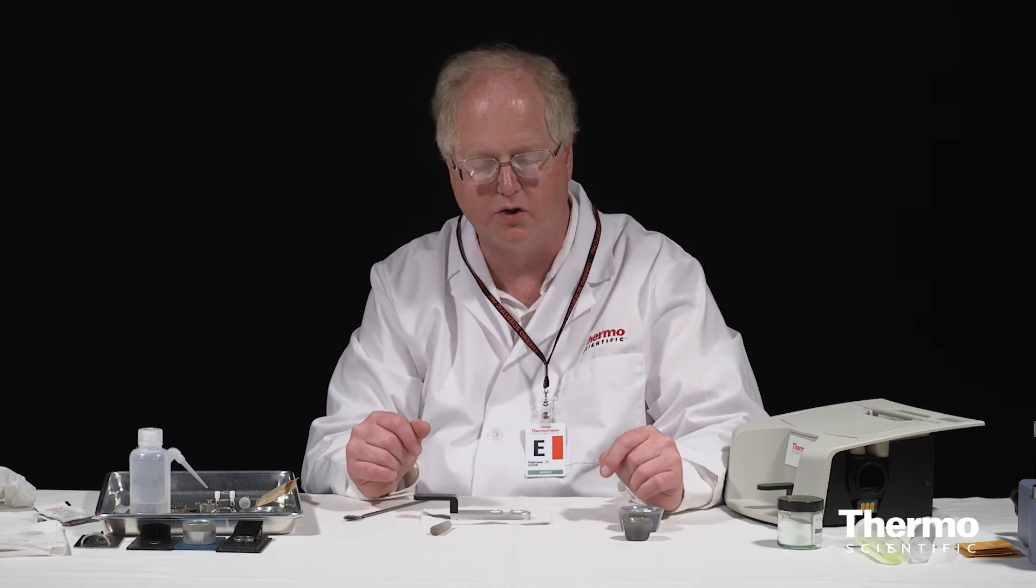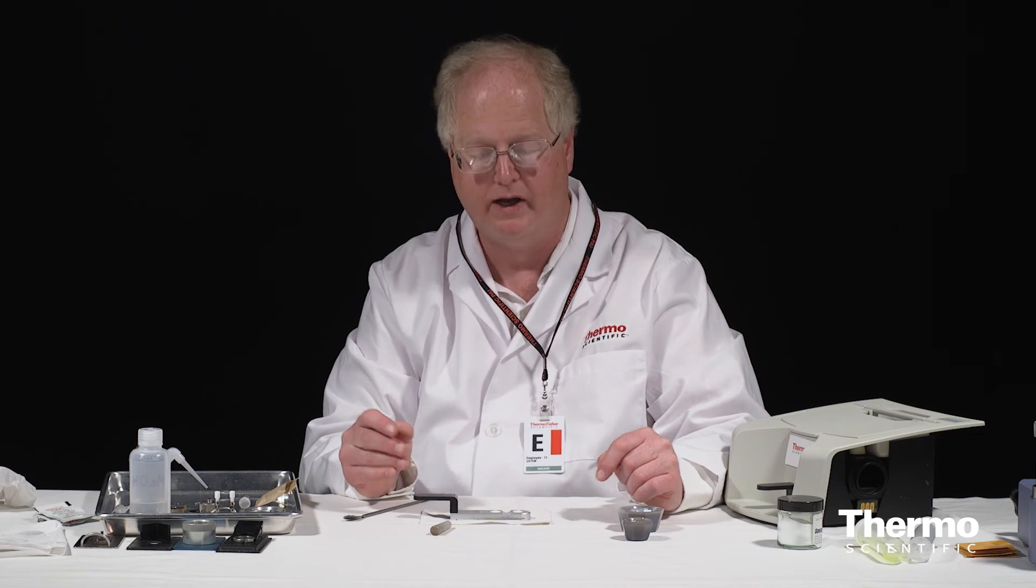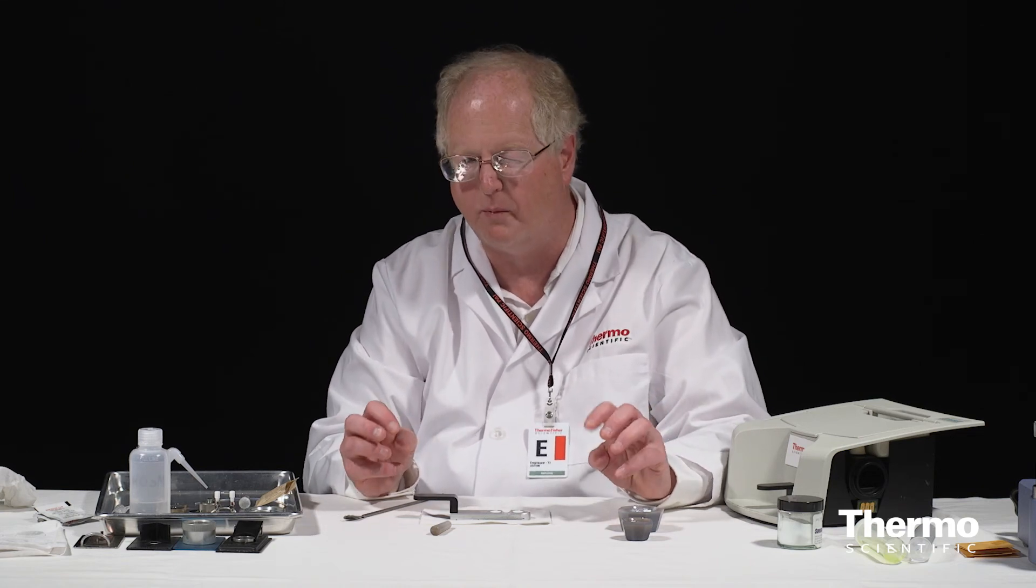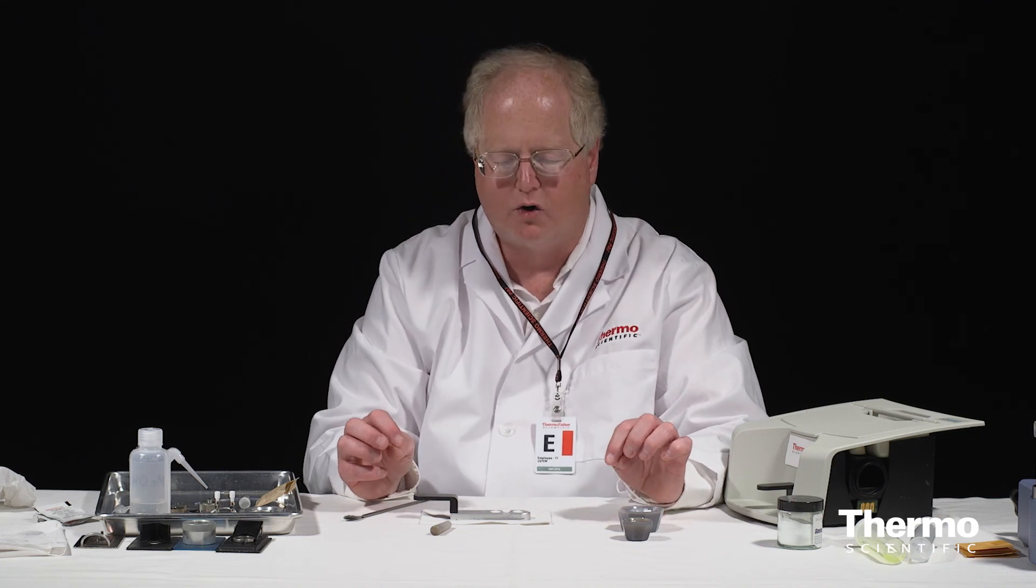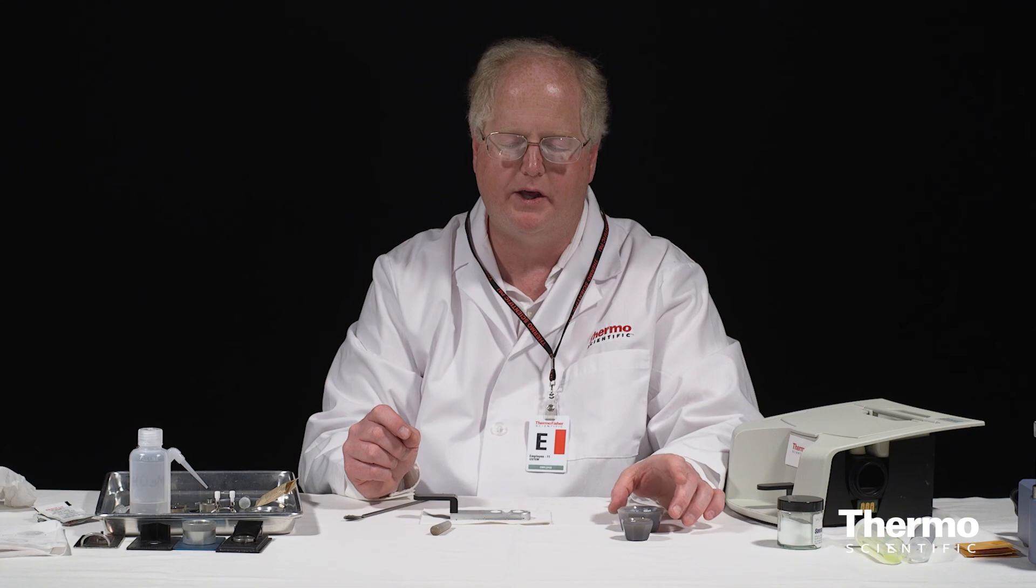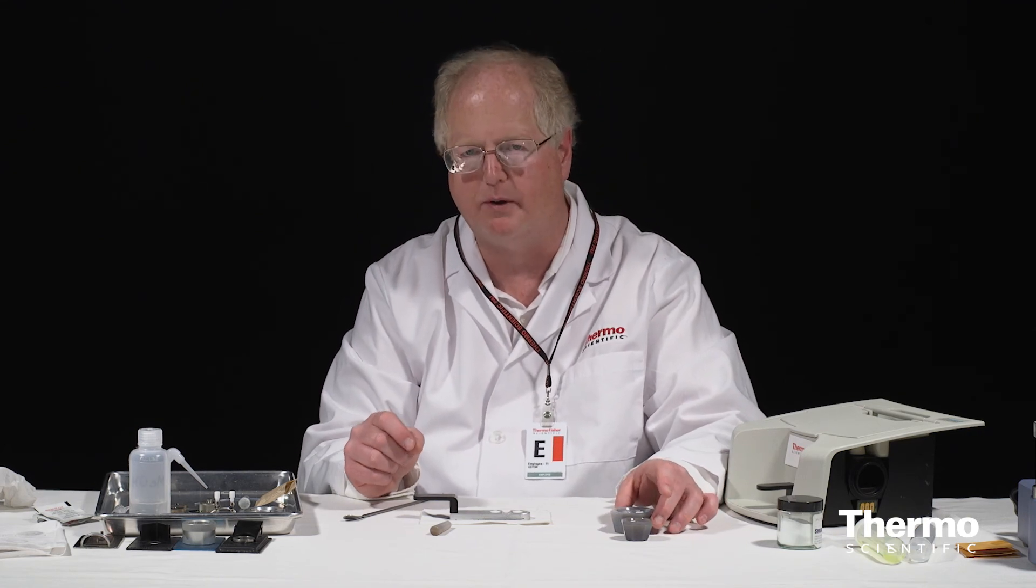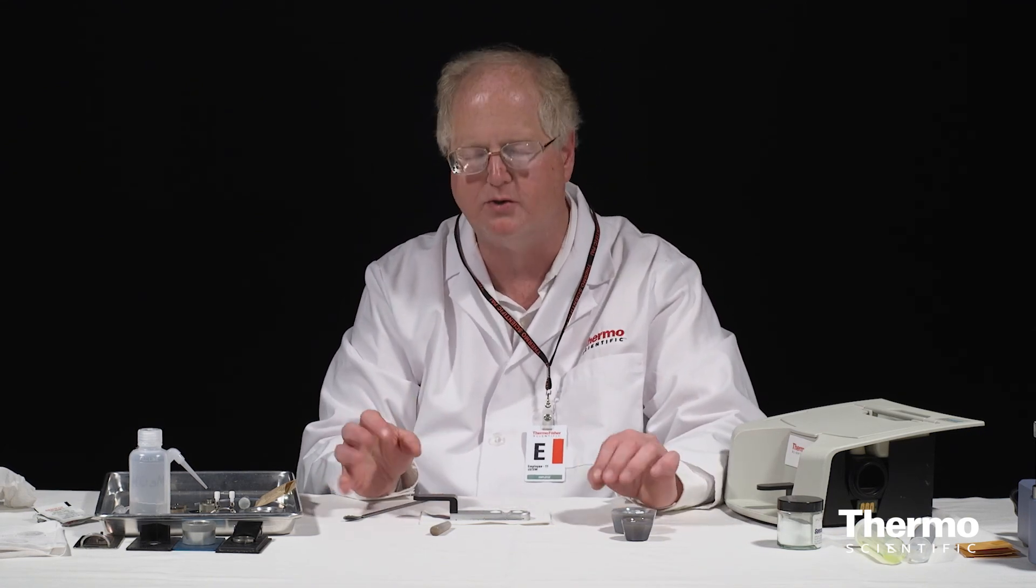So that's the preparation of DRIFTS. The key things: first of all, the grinding, to make sure you have really fine, almost a powder, very fine powder, not crystals. You shouldn't see a lot of crystals, you should see a powder. And also that you don't add too much sample. I'm going to stress that every time we talk about DRIFTS. One of the main problems with it is people just use too much sample, and then your peaks go off scale, the spectra look funny, they have extra bumps in them, whatever, because there's just too much absorption.